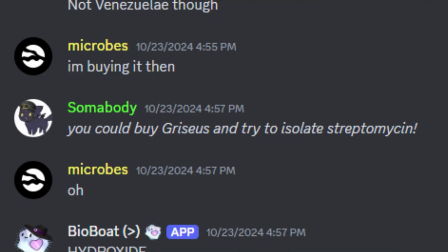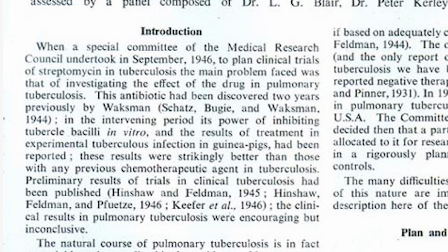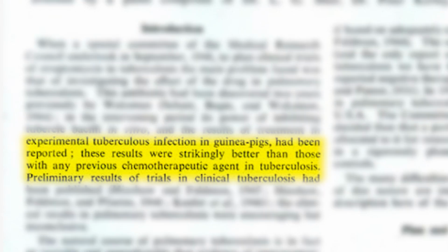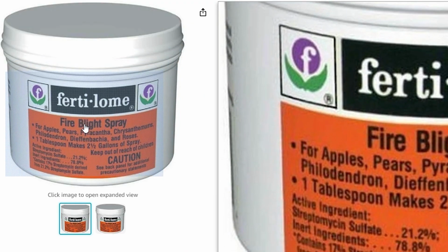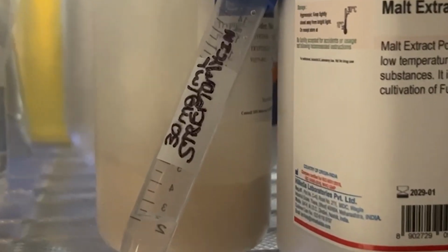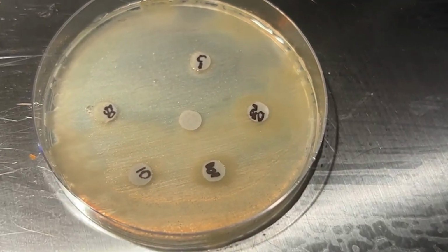Streptomycin is an antibiotic produced by Streptomyces griseus. It was originally the first antibiotic to be found to be effective against tuberculosis. But after resistance and toxicity issues I partially blame agriculture for, it is no longer used on the medical side. Antibiotic resistance would make it so I would need much more of the antibiotic to have the same effect on the bacteria, or it just wouldn't work at all.